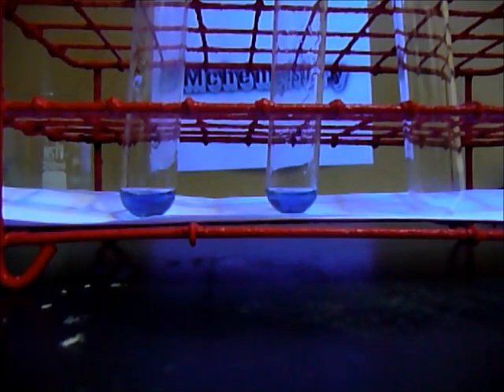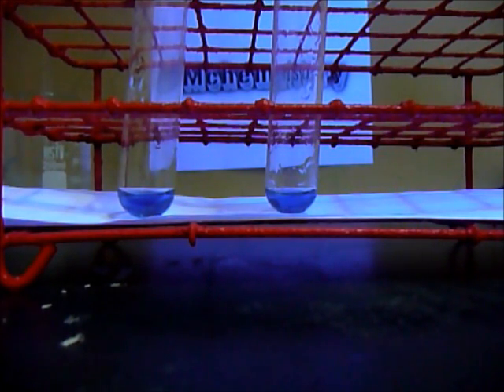That's about enough. Okay. So, to test for it, this is a clear solution. To test for it, I'll be getting some test tubes and adding exactly about 1 milliliter in each test tube shown here. Okay. 1, 2, 3. Okay. Wow, I just broke this. Whatever.